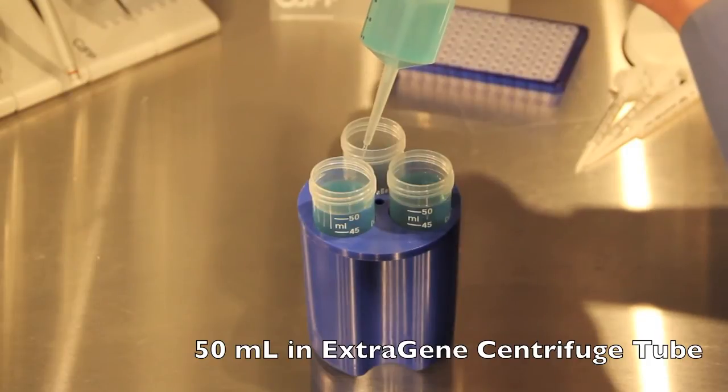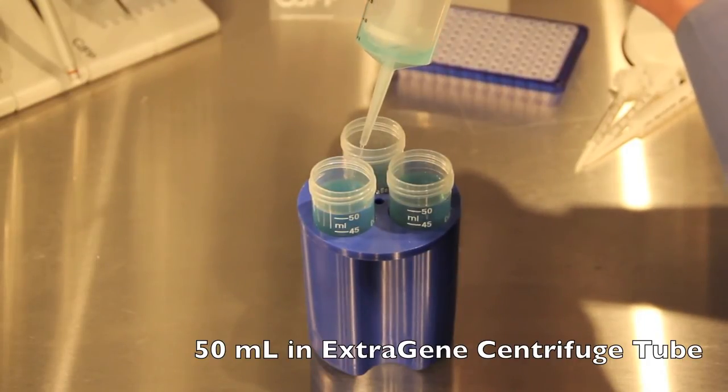And finally, we are able to dispense 50 mils into a 50 mil centrifuge tube.